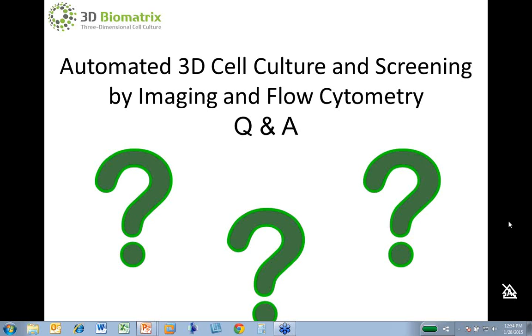Just also, I'll add to that. The reason we initially chose polyvinyl alcohol was we had done some earlier work using human iPS cells where, without the PVA, we couldn't get any sort of embryoid body, but in the presence of PVA we could. Again, for the HCT116 cells, it was not necessary. They would form excellent spheroids on their own. It was just really useful to speed up the process.